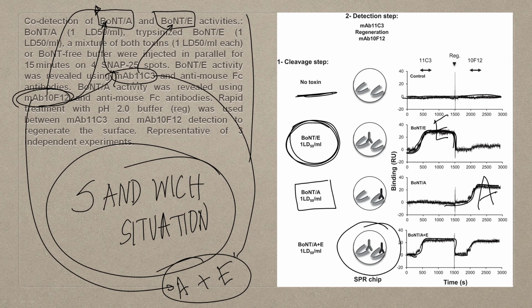This is like this, right. So, this is for E, this is for A. So, at one point of time, without any label, you could detect different fragments of SNAP25 using specific monoclonal antibodies against those cleaved peptides.